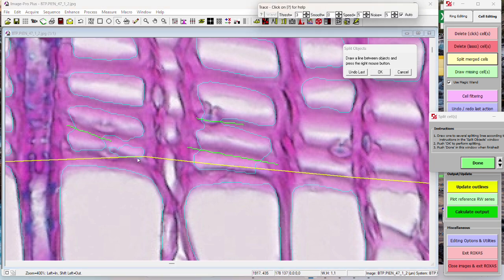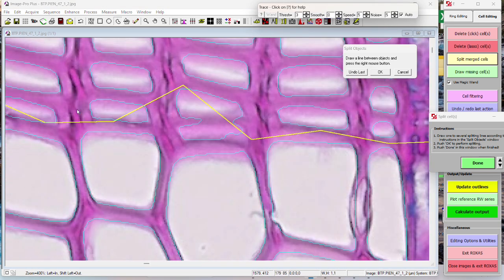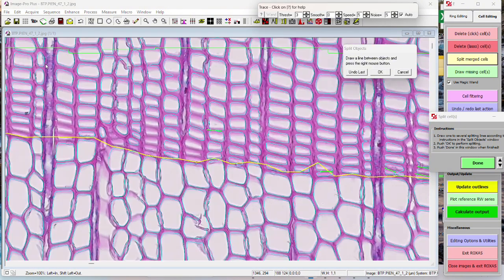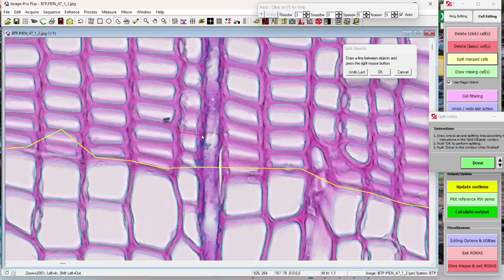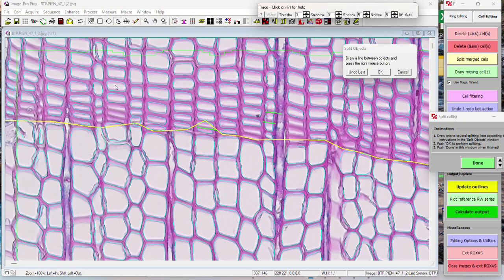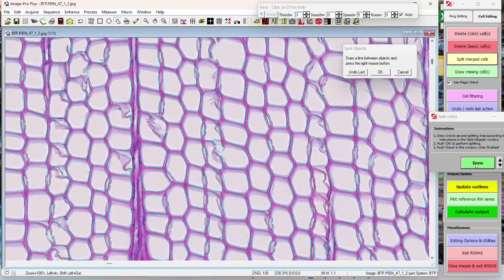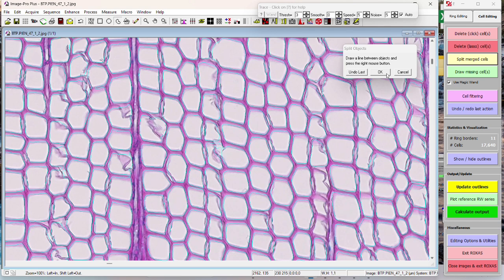But basically, I would actually end up deleting both of those. You'll just go through each ring. If there are only one or two of these, don't really worry about it. It wouldn't hurt to delete them, but it's really not a big deal if there are a couple of these. But if there are a lot of them, that's going to mess up the average and the measurements, so we don't want that to happen. And yeah, let's see if it crashes again.